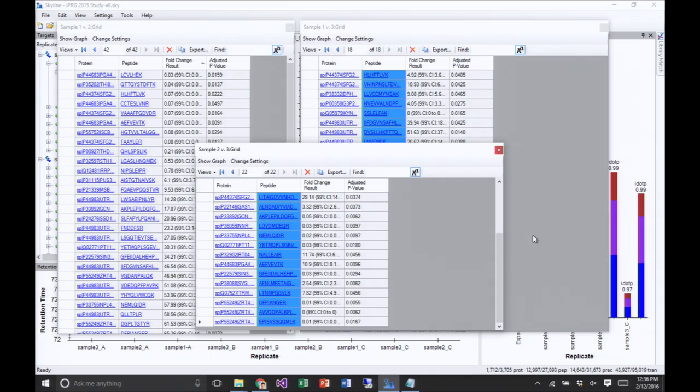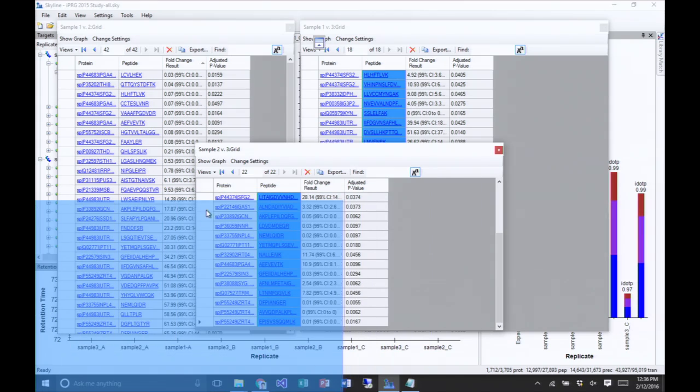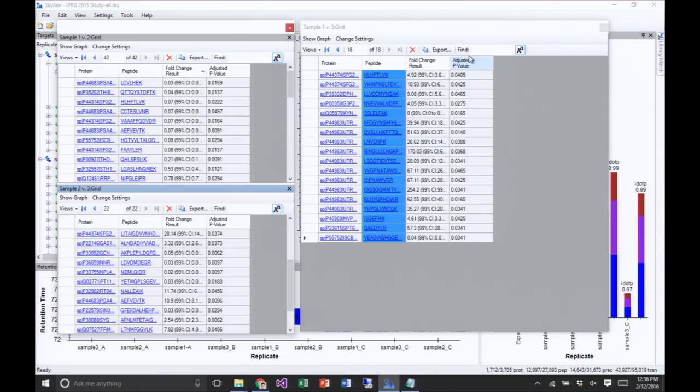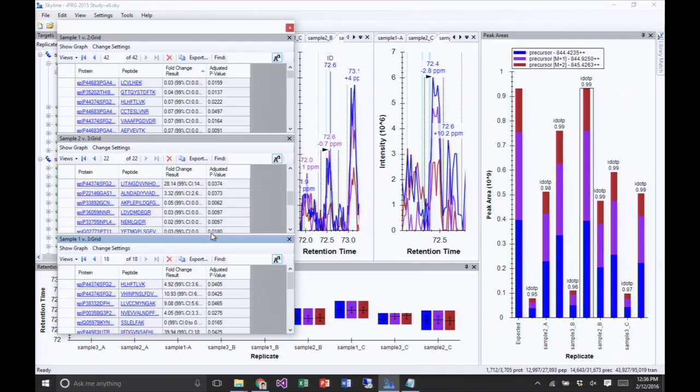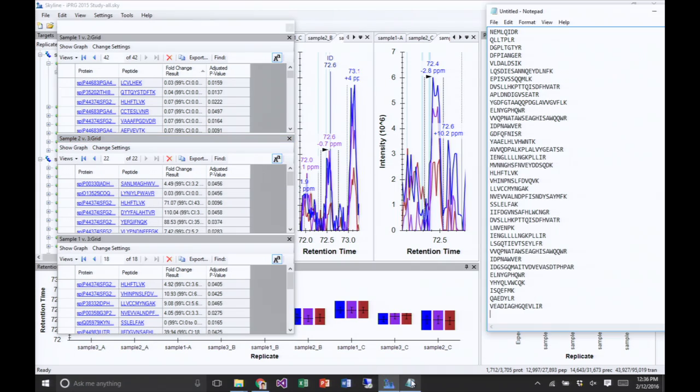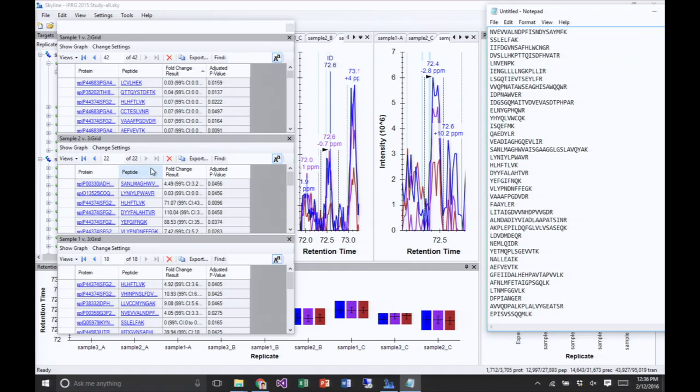And we'll copy those too. We can also dock these windows together if we want, so that we put all 3 together into one panel of 3 comparisons here. Did I paste those yet? All right, anyway, so paste the last group of 22.